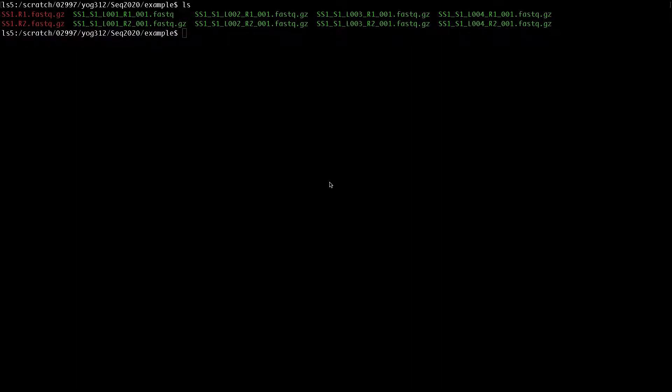The question is: once you have completed your DNA sequencing, you want to know how many reads you have in your FASTQ files. That's what I'm going to show you today. Before we get into counting the number of reads, I first want to show you how a FASTQ file looks.